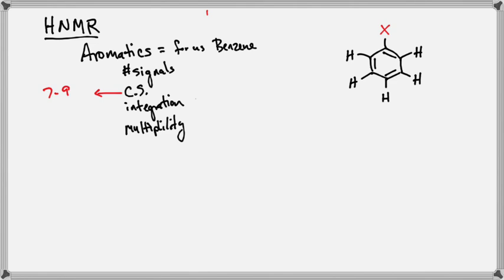That becomes dangerous because if I put 2 things on the ring, I could place it here, or here, or here. And that's going to potentially change the amount of peaks I get. It could also mess with my integration a little bit. But if I'm seeing those things, I've got more context behind this. Does that make sense?